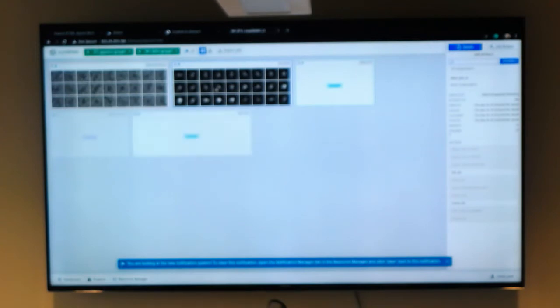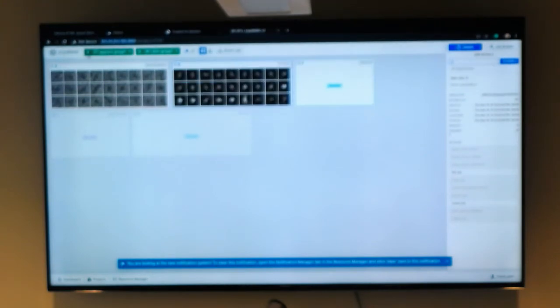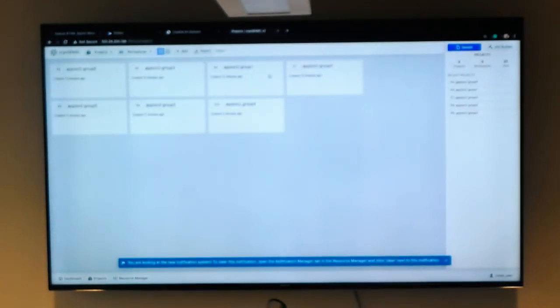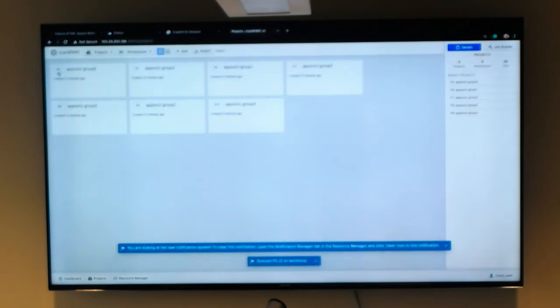In case you haven't gotten here, I believe everyone has, but this is the IP, and this is a static IP that will be open for the remaining part of the day. If you have any questions, we can start seeing the various groups' runs, and if need be, we can pop in and monitor and see where people are and where people get stuck.